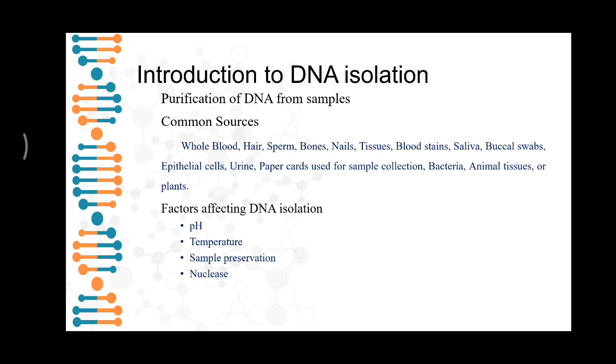So DNA isolation basically says that the purification of DNA from samples.